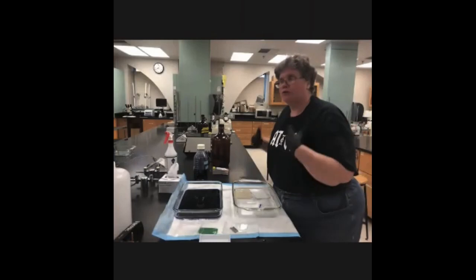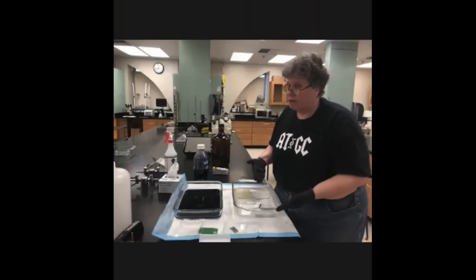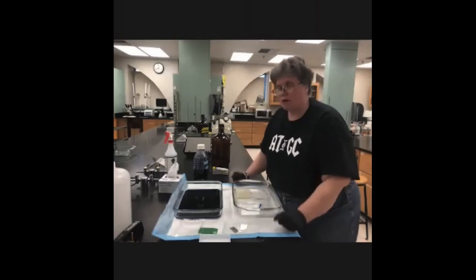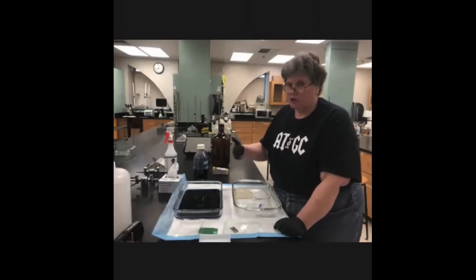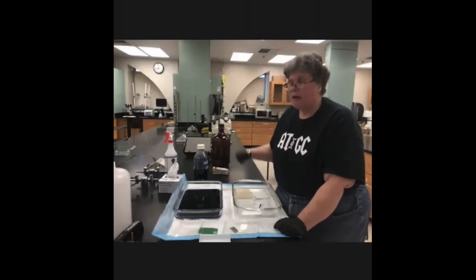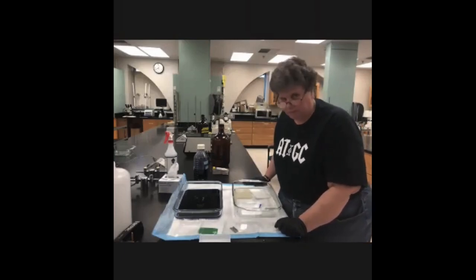You're doing multiple to have the maximum usefulness possible, because it takes pretty much the same amount of time to do one as it does to do 8 or even more. So the more gels you have that are going to be destaining, the more destain you need, or the longer periods of time, or the more buffer changes you need. So your goal when doing the destain is to basically have your gel material fairly clear while having your proteins colored dark blue.